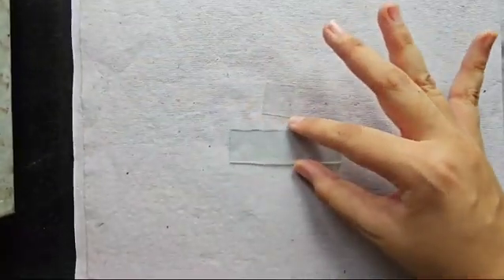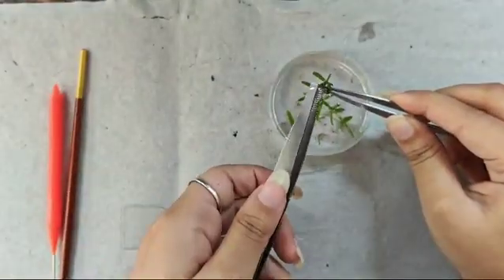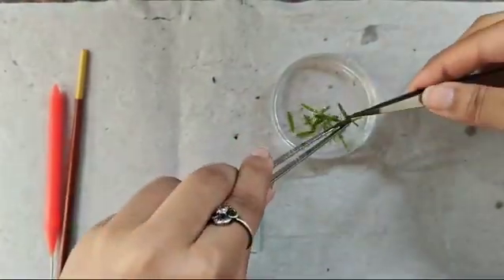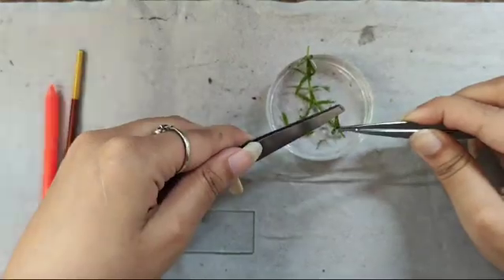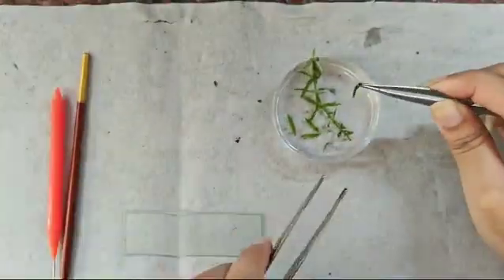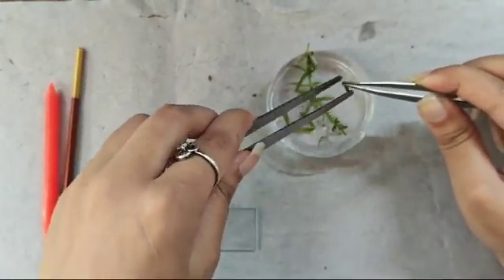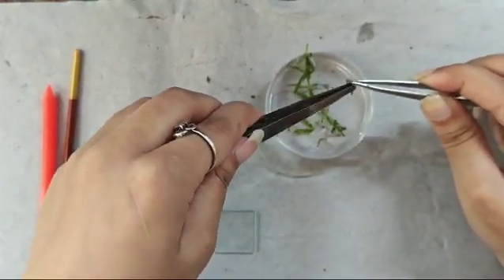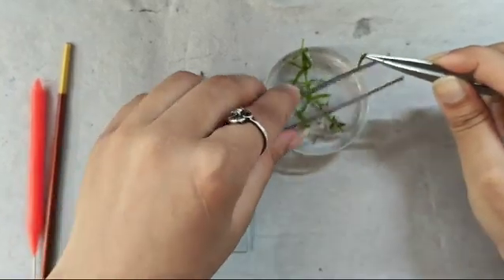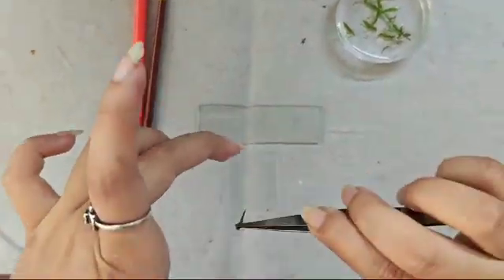To prepare the slide to observe cytoplasmic streaming in hydrilla, we need our sample in a petri dish, forcep, and needle brush. We take the uppermost leaf of hydrilla from the sample that we have prepared. Taking the leaf from the uppermost section of hydrilla, we will put this leaf gently on the slide.